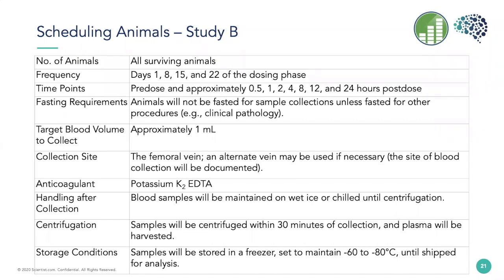So now if you talk about these study examples, both of the ones that we gave you occurring on the same day, you can see that it's getting really complicated, but it's actually a common occurrence for them to overlap. So now you'll have to schedule all of these animals from different studies, different time points, and in different groups and subgroups. And it gets really difficult to keep straight manually, as well as on paperwork. Usually your hand is going to cramp up at this point.